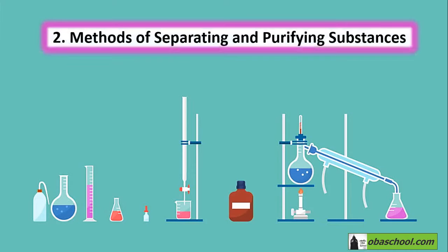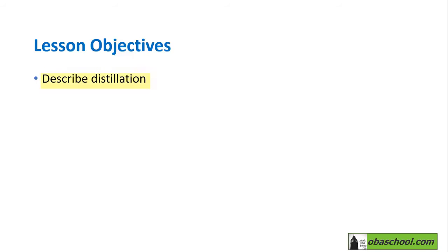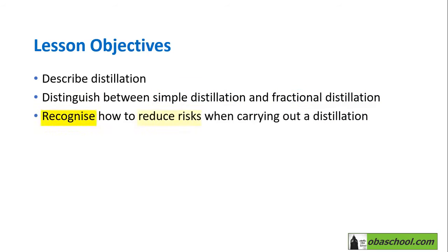Welcome back to Chapter 2, Methods of Separating and Purifying Substances, Section 2D, Distillation. By the end of this video, you will be able to describe distillation, distinguish between simple distillation and fractional distillation, and recognize how to reduce risks when carrying out a distillation.